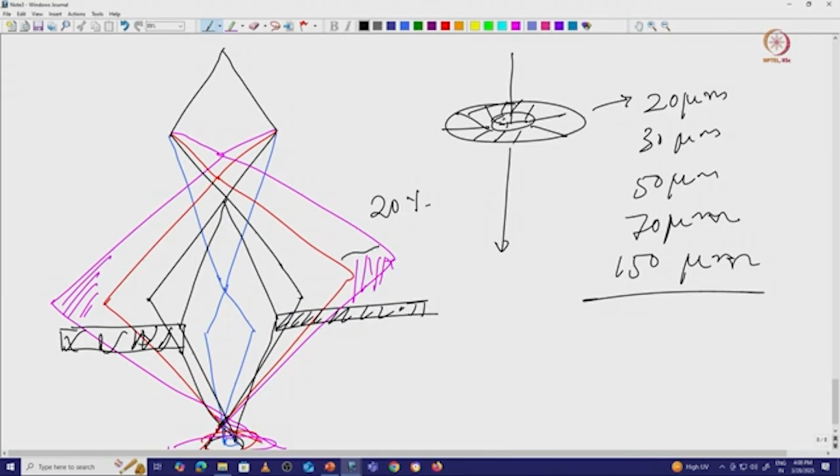So now you can see that I am using a very strong spot size, a very strong magnetic field, meaning that the spot size is 8, where the crossover point will go up. When the electron beam spreads like that, I will use a smaller aperture size and try to block the beam. Here we are blocking almost 50% of the electron beam.